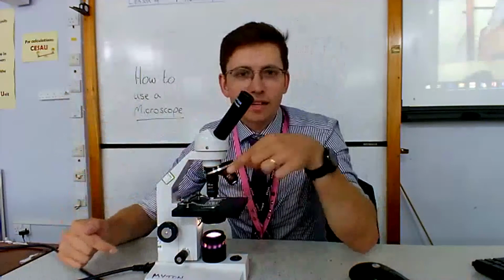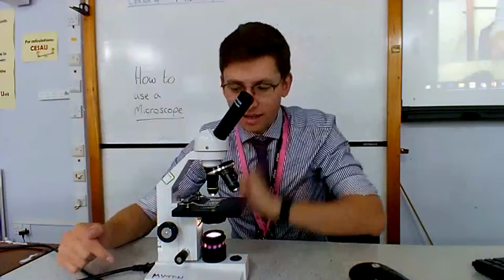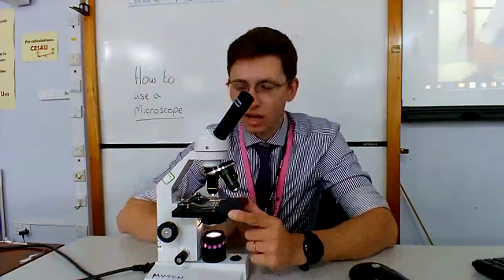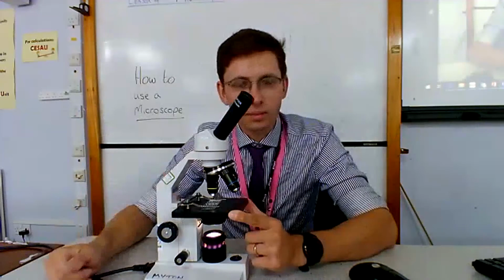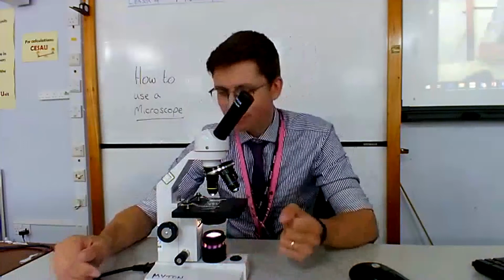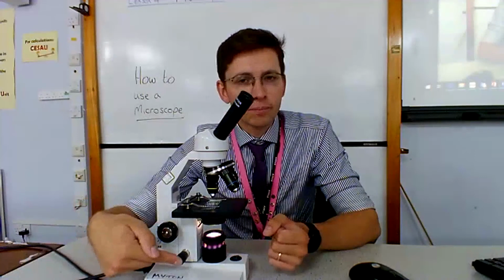and get higher magnification the bigger the lens is. It's written on the side as well, so you can see the magnification. Down to the stage here, where we place our specimen, our glass slide, underneath the stage clips that we can see that hold it in place. Underneath we have our light source that can get very, very hot, so we've got to be careful with that. And when I look through, I'm going to use my coarse focus wheel and my fine focus wheel.